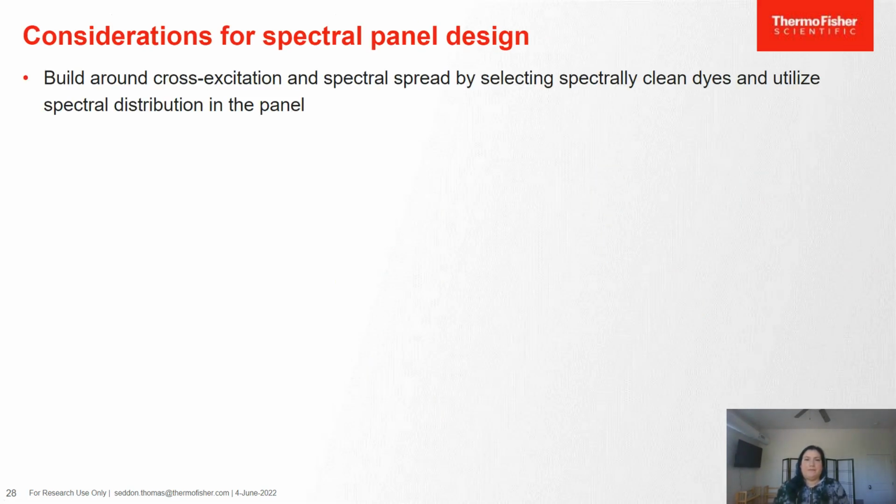So now, stepping back and thinking specifically about spectral panel design. The goal is to build around cross-excitation and spectral spread by selecting spectrally clean dyes and utilizing the spectral distribution in the panel.